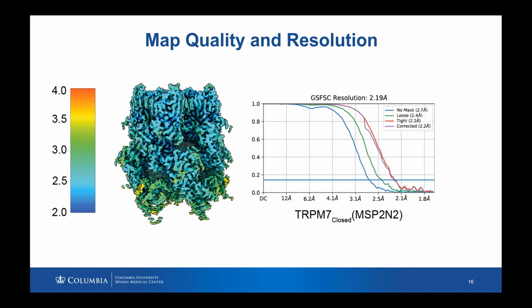One thing that we observed, when we used a very specific detergent called digitonin, which also worked for our extraction, it looks like the digitonin substitutes cholesterol, but only in this case. In all other cases, we always see cholesterol bound to the protein at the same spot all the time.